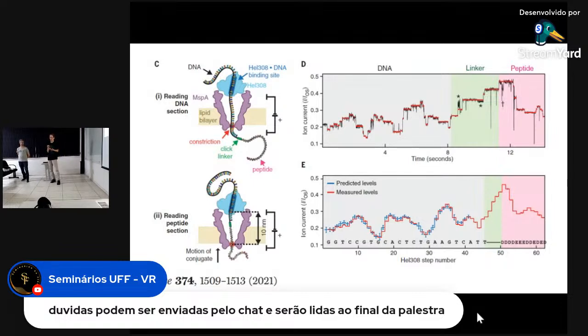I also think it's very hard to believe that you can get so many different ionic current levels and make them out under the noise. One of the things we discussed just yesterday, in Sao Paulo, is that maybe you can use something to couple to the amino acids to make the fluctuations less, or make the interaction with the nanopore more specific, so that you can distinguish better between these 21 amino acids. It's very challenging, but everybody working in the field, including me, is very optimistic that we can overcome these challenges somehow.